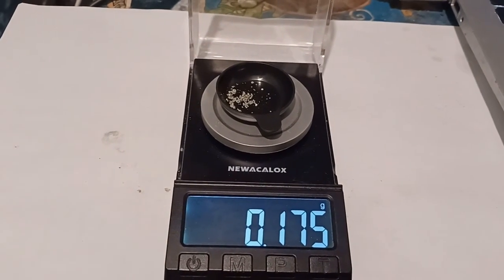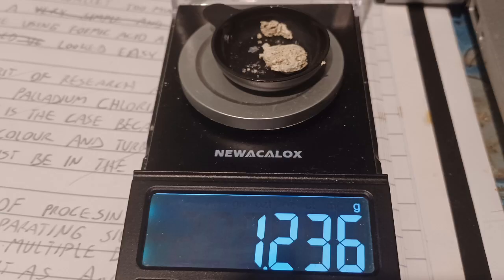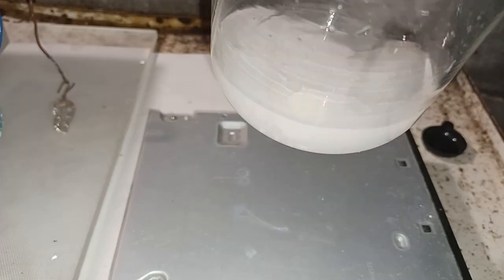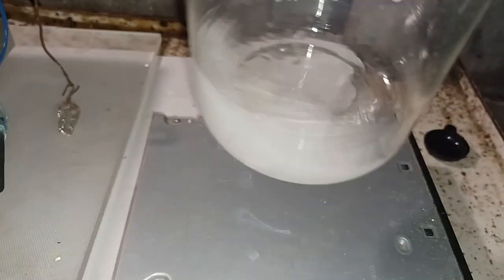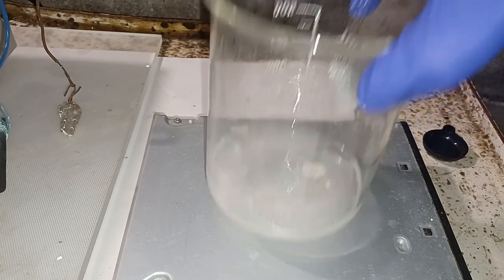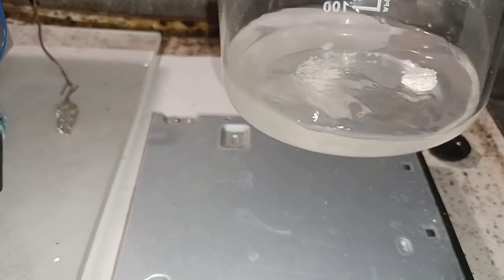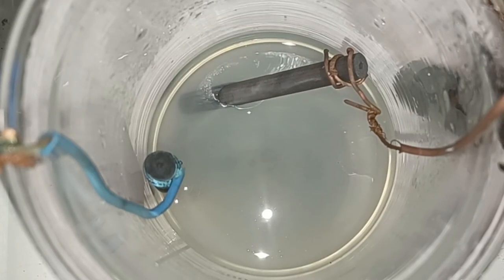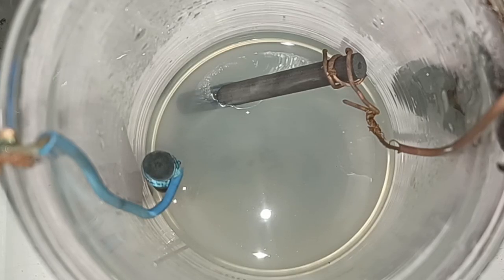Thankfully there are methods that do not require high temperature. The next method I tested was an electrolysis of a silver-ammonia complex. I transferred the silver chloride into a beaker, added some distilled water, and slowly added ammonia until all of the silver chloride dissolved because of the formation of a water-soluble diamine silver complex. I assembled an electrolysis cell by connecting two inert graphite electrodes to a lab power supply and slowly began to increase the voltage until I got a good current.